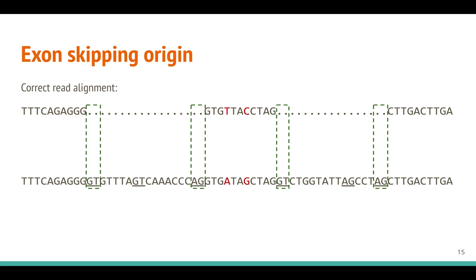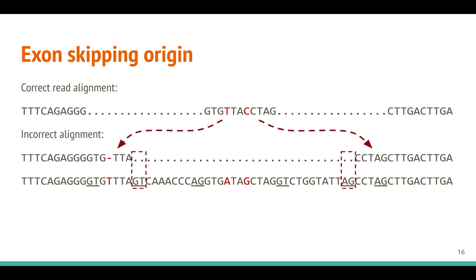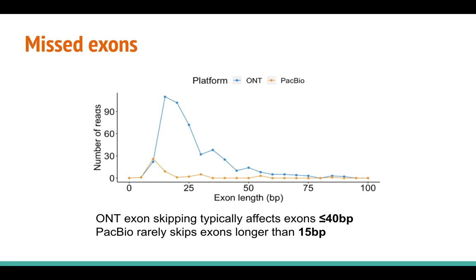Here we show an example of an exon skipping event. If an exon is relatively short, the aligner software can erroneously map a read and skip this exon. PacBio and nanopore skip exons shorter than 15 bases with similar frequency. However, ONT exon skipping also affects exons up to 40 base pairs in length.